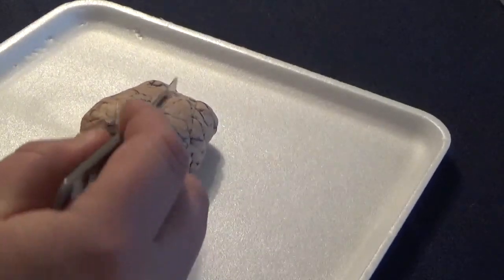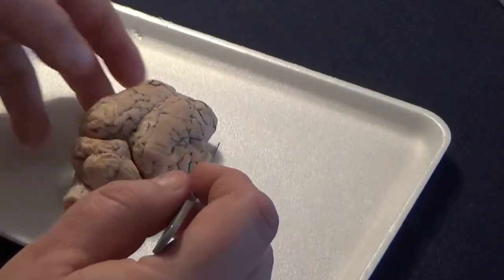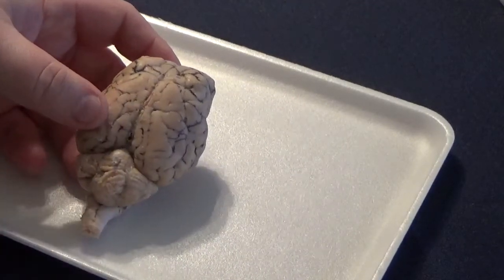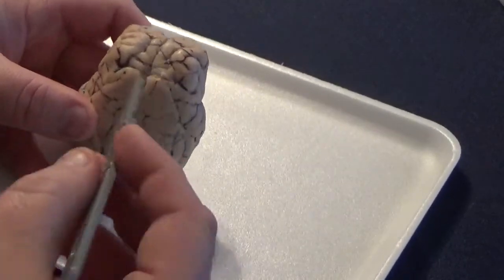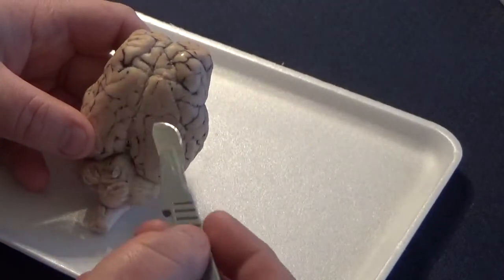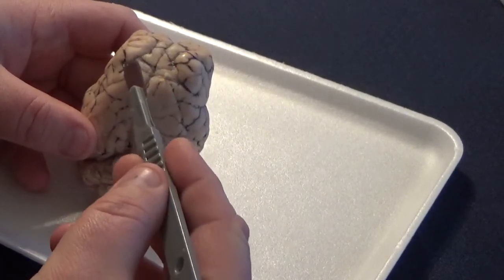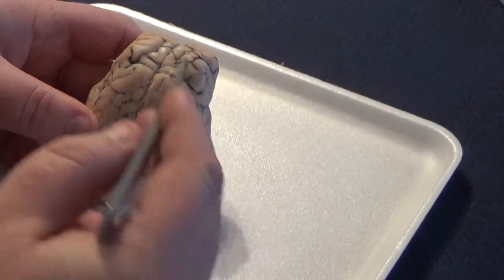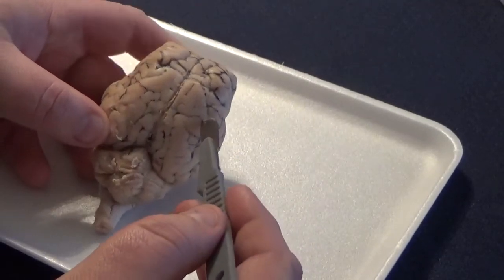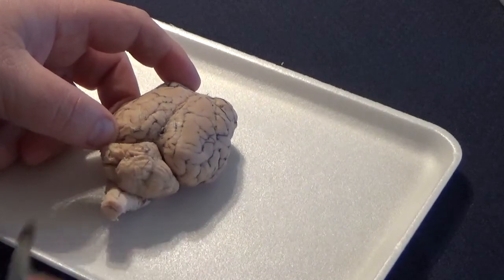All right, so looking at the brain, we can also identify some features. In the cerebrum, there is a line that separates the left hemisphere from the right hemisphere. This line is called the longitudinal fissure. So this is the longitudinal fissure, this line. At the very top, there's a line that separates the frontal lobe, this part here, from the other lobes, the parietal, temporal, and occipital lobe. It's not quite as pronounced or as visible in sheep, but it's called the central sulci. So we have a central sulci here, and we have the longitudinal fissure here. We have the left hemisphere here, and the right hemisphere. Here's our cerebrum, and then here's our brainstem.